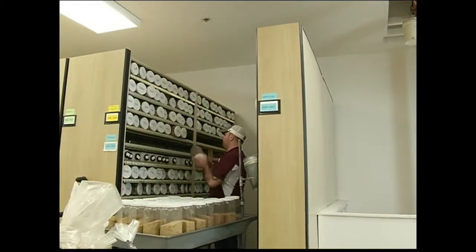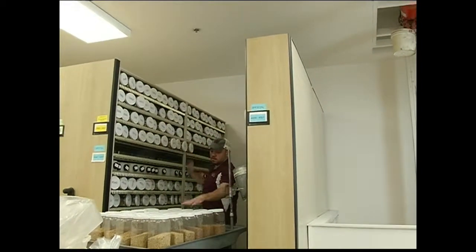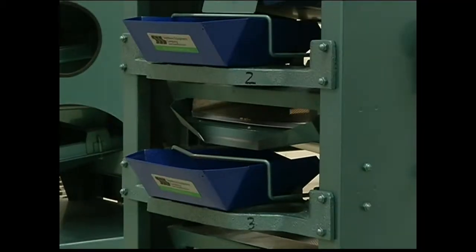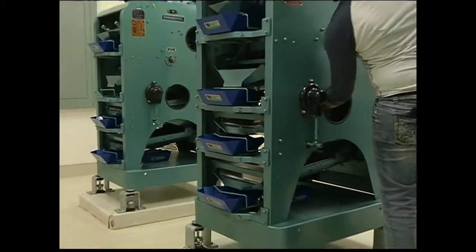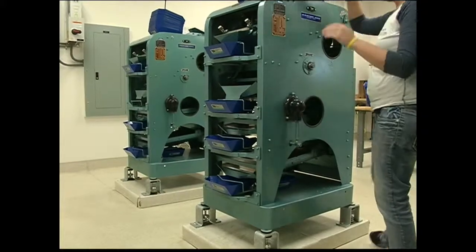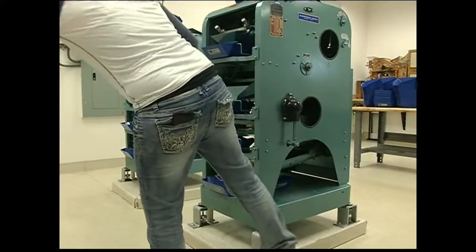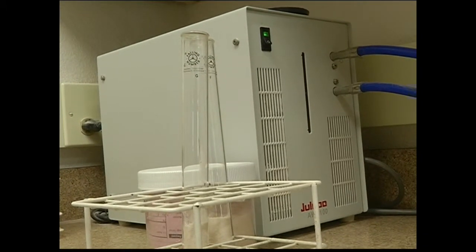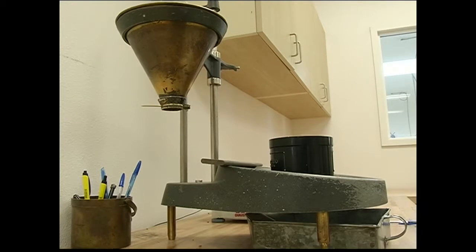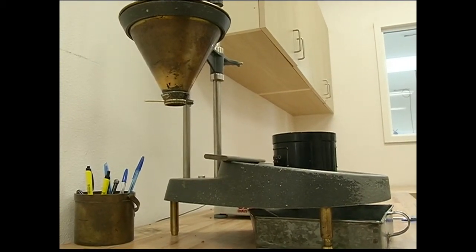So the work that Lauren was doing, we were showing grain inspection, and he was going through that sample. Essentially 1% of our samples are randomly selected each day. We bag up those samples and they're regraded in the federal lab. And we look at those results for quality control to make sure that the inspectors are consistent all day long, every day. Rumney says that federal regulation further establishes the State Grain Lab as the premier analysis site in Montana.